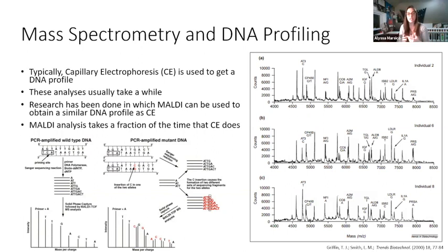So what happens is we either do mitochondrial DNA, which is still not unique, right? It's not individualizing. Mitochondrial DNA is also very, very time consuming and expensive. So you can only do it at specific labs. You have to send the sample out if they approve mitochondrial DNA to be done on the sample. But you still may not get individualizing information. So what I'm working on is using GC Mass Spec to analyze the proteins present in your hair, and looking at that as a way to individualize hair samples.